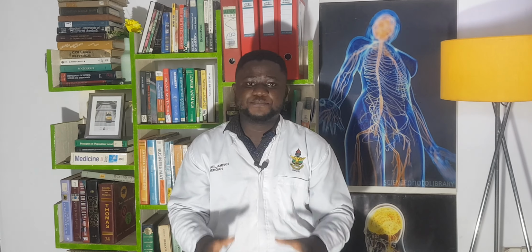And so we use UV light through the specimen, and through the principle of fluorescence, the UV light is converted to light of lower energy. And that's because the UV light loses energy. And when it loses energy, it now has a longer wavelength, such that it cannot be within the UV spectrum again, and it shifts to the visible spectrum.